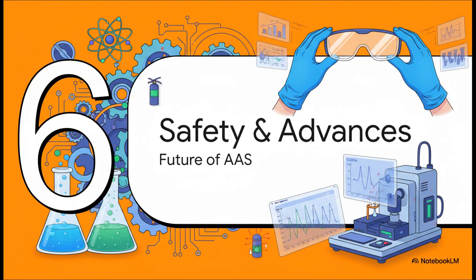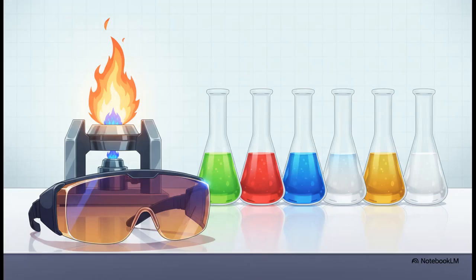Safety, Advances, and Summary. Let's bring it all home with lab safety, some amazing new tech, and our final takeaways. We have to talk safety. Never, ever underestimate the physical hazards here. We're dealing with incredibly volatile air-acetylene flames and intense UV radiation from the lamps. But beyond keeping your eyebrows intact, there's your analytical safety, your quality control.